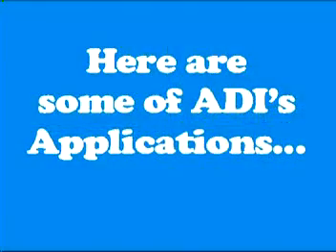You have just seen how ADI's ball and tube visual and Visual Plus alarm indicators work. Here are some samples of ADI's ball and tube applications.